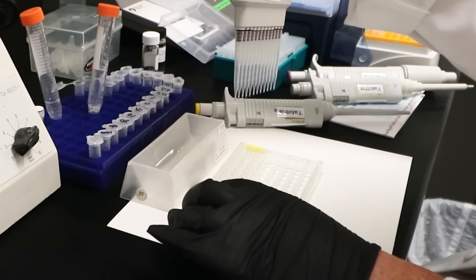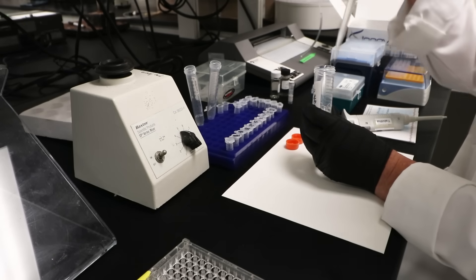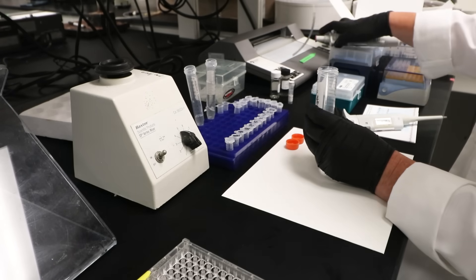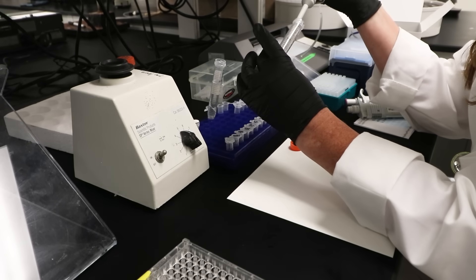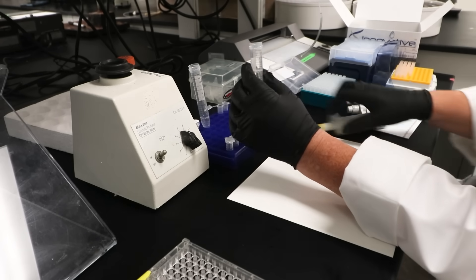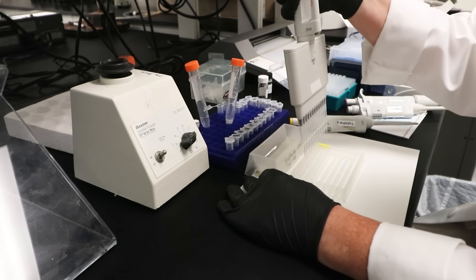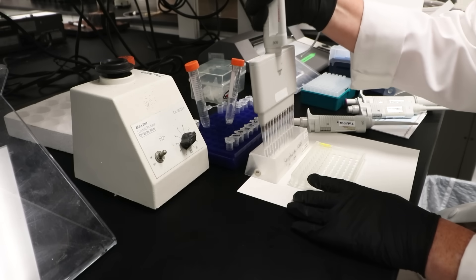Now it's time for the streptavidin HRP addition. Briefly centrifuge the vial before opening. Dilute 2.5 microliters of HRP conjugated streptavidin to 2.5 milliliters of blocking buffer to generate a 1 to 1,000 dilution. Add 0.1 milliliters of the 1 to 1,000 dilution to 9.9 milliliters of blocking buffer to generate a 1 to 100,000 dilution. Add 100 microliters of the 1 to 100,000 dilution to all wells. Then shake the plate at 300 rpm for 30 minutes and wash the wells three times with wash buffer.